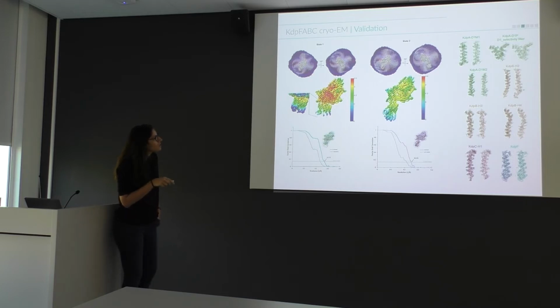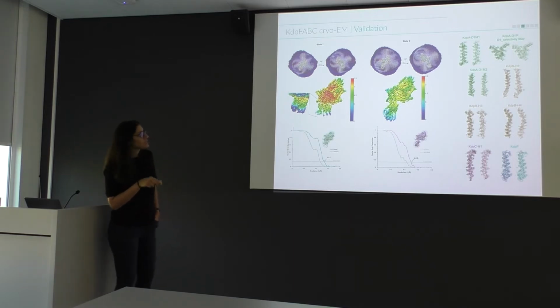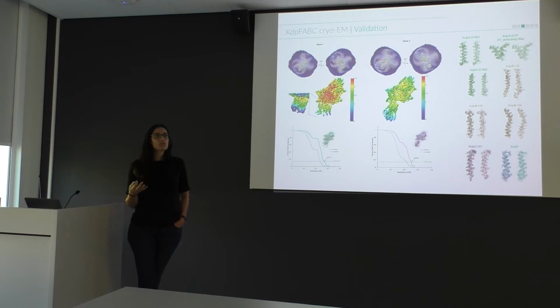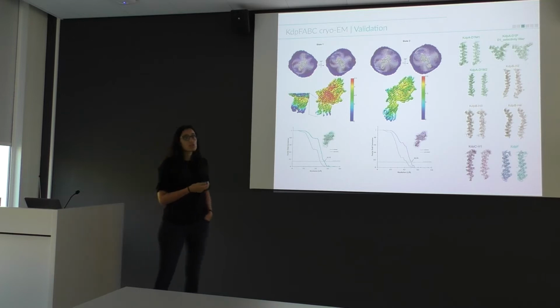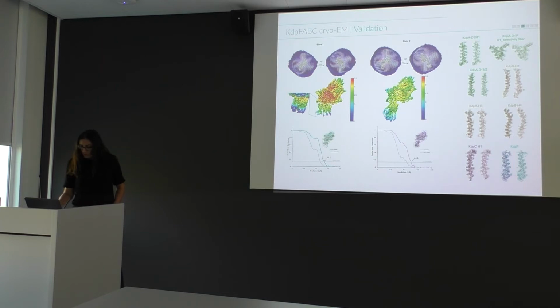While state 2 is actually better. It's a little bit lower resolution overall, but here we had a more confined conformation. You see also from the helix density that the building was straightforward, and this is of course where the X-ray structure became very handy. It doesn't mean that you get scooped, it actually just helps you, because with cryo-EM, if you work with these type of proteins, if you want to stay realistic, you normally do not get the resolution that allows you to very confidently build a de novo model. So if you have any structural information, you can just benefit from it. And we did. So we built a model into it.